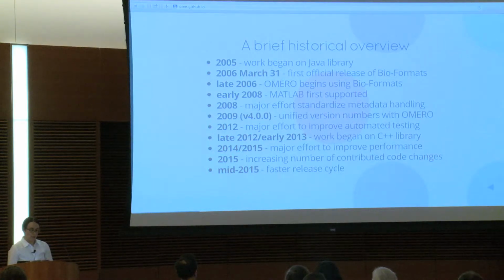Also in 2008, OME-XML was maturing as a standard, so we made a concerted effort to fully implement the OME-XML schema and to use that as the primary means of describing the acquisition metadata that's associated with an image and contained in a file.